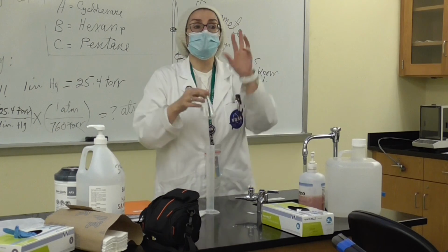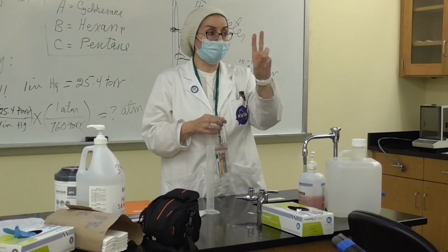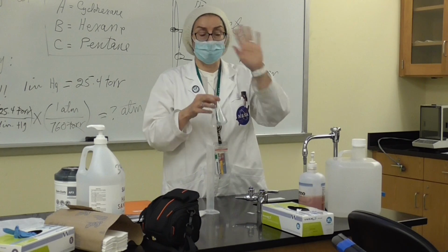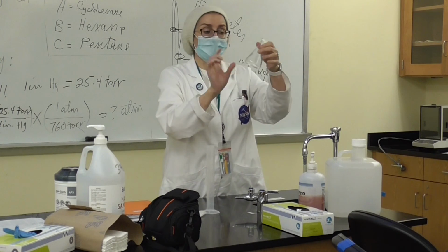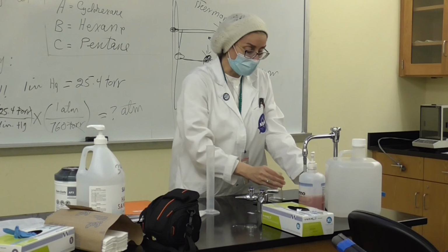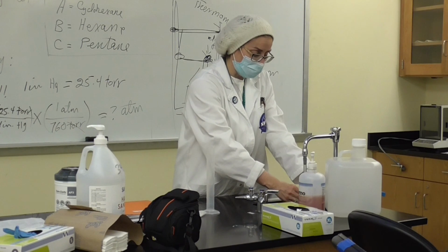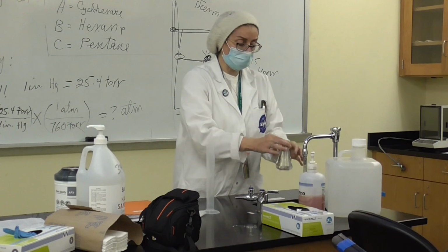So after you finish with the second trial or third trial and you're done, you're going to rinse it, remove the stone, remove the foil, fill it to the rim with the water, okay? So that's what I'm doing. Tap water, any water. Fill it to the rim, okay?